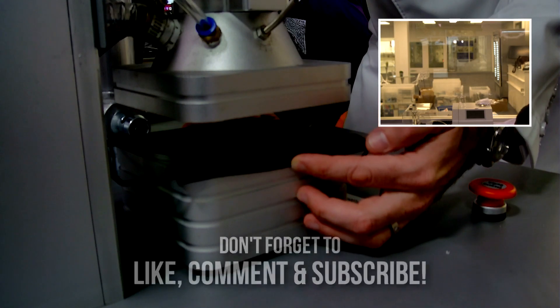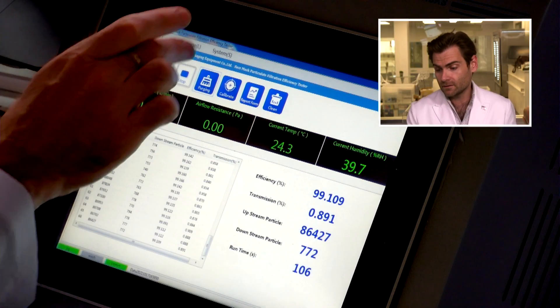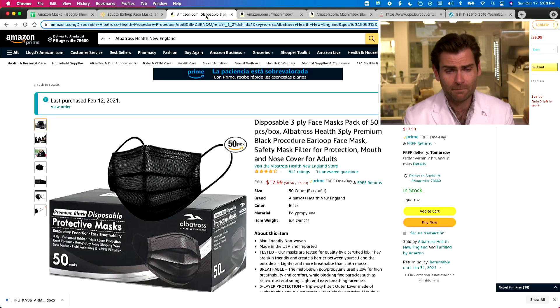Last time I did this I totally clamped my hand — not this time. This is a PFE machine, a particulate filtration efficiency machine. We are doing the American test on an American mask.